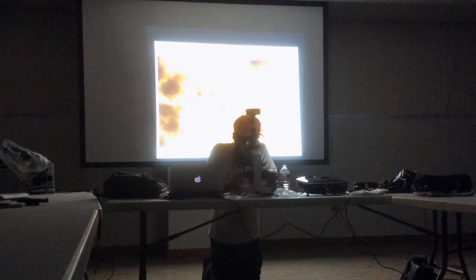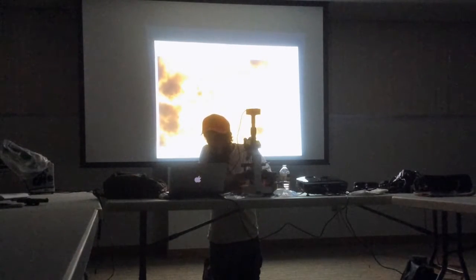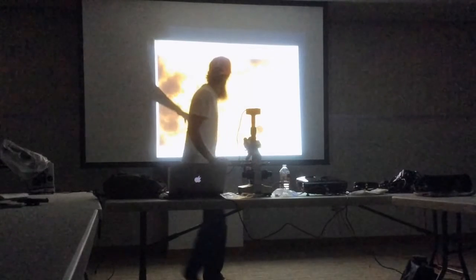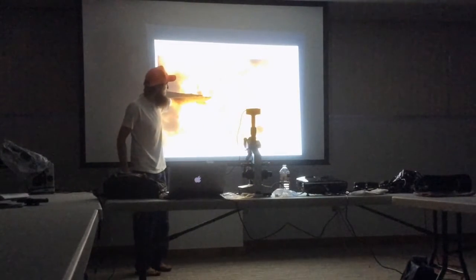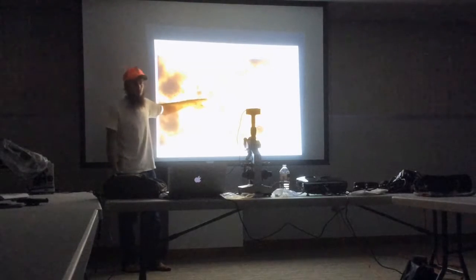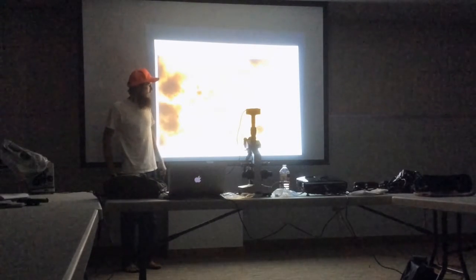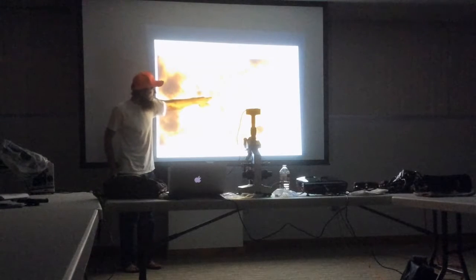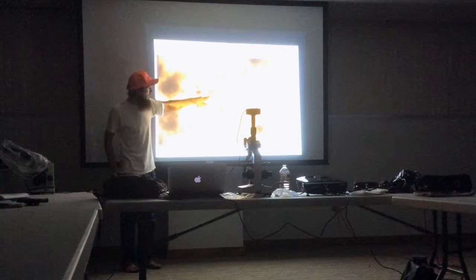And so here, okay, yeah. This guy here is a fungus growing throughout my sample, but is this one beneficial? This guy right there looks dark.